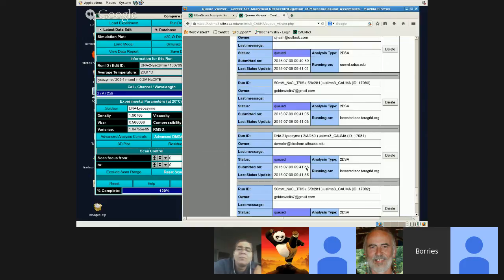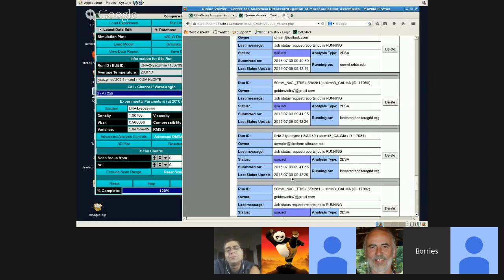So that's kind of nice, but right now it's kind of bad because I wanted to show you and I didn't want to wait at all. But it's very busy today for some reason. Now it says here our job is running, which is strange because here it still says it's queued. But eventually it will probably work. Are there any questions while we're waiting?